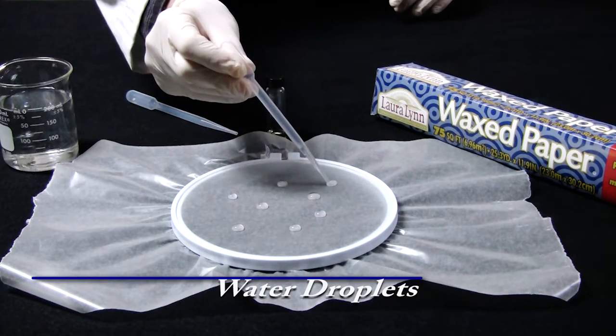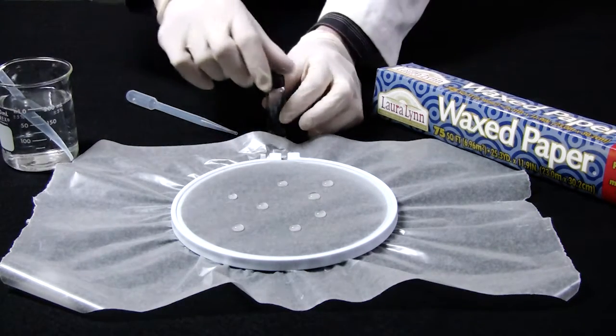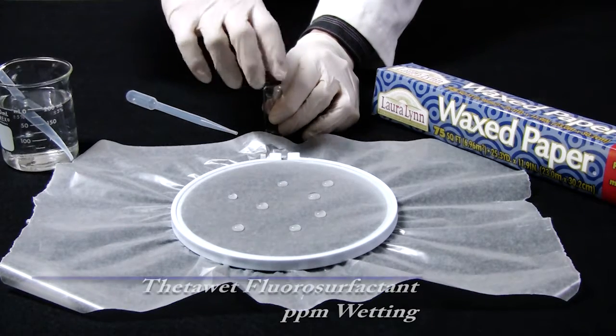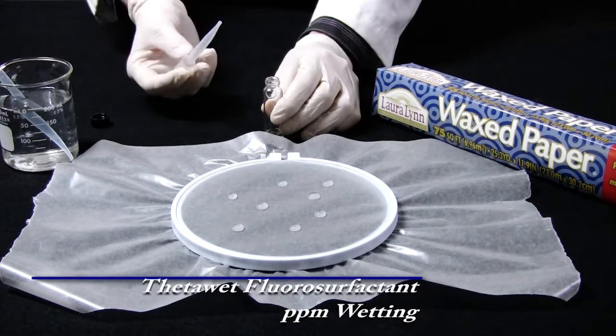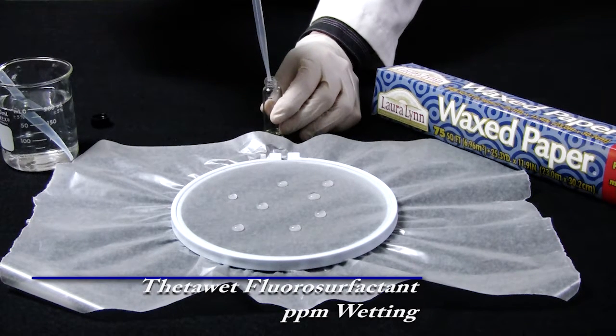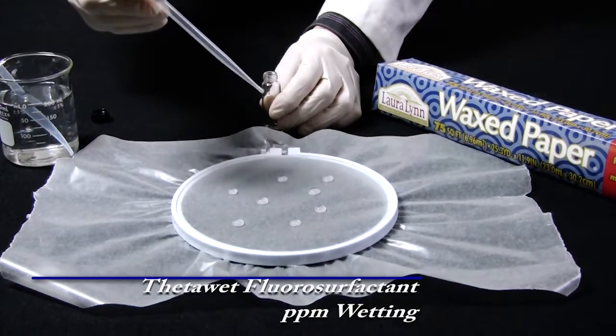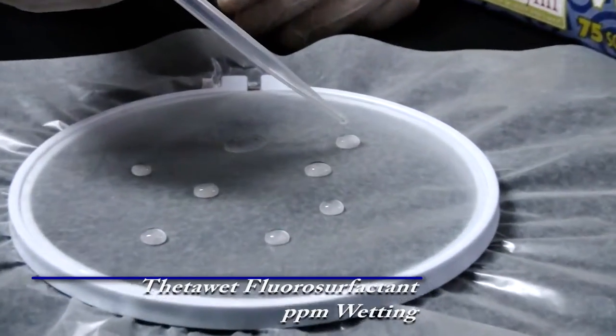Next, the laboratory technician will take a very small amount of fluorosurfactant on the end of a pipette. As the technician adds a few parts per million of the fluorosurfactant to the deionized water, it is now able to wet out the paraffin wax. Addition of the fluorosurfactant drops the surface tension by over 50 dynes, and so the surface tension is lower than the 26 dynes of the wax paper and can easily wet out the surface.